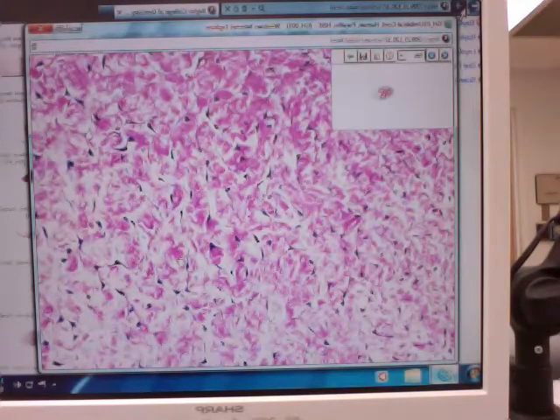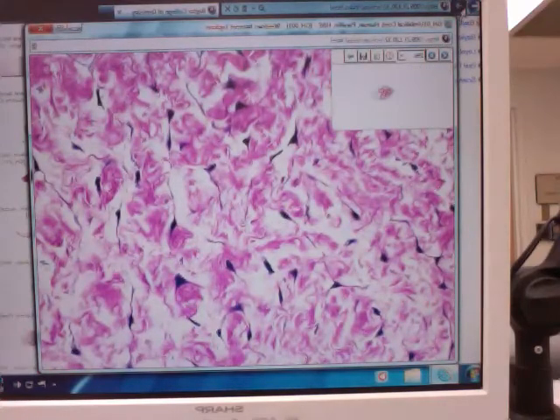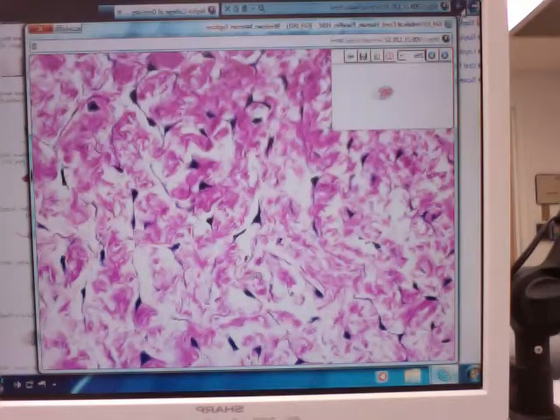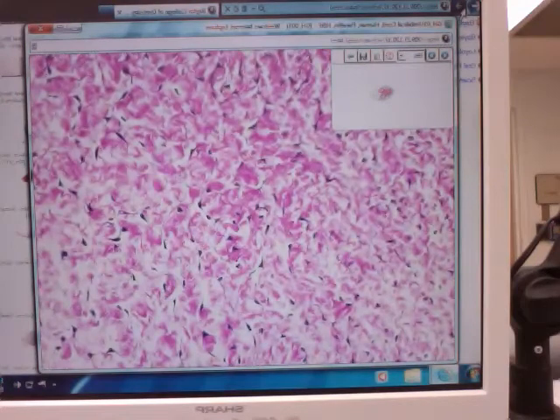Plus, if you look, all these cells have that true class. If you want to show somebody what a fibroblast looks like, this is the perfect place, because you see all these little skinny, stretched out cells. They're just classic fibroblast in nature, a nucleus with all of its cytoplasm extended out from it, and then you got these bundles of fibers inside of there. Nowhere else do you see these, because these are newly formed fibroblasts and they haven't gone through a further round of differentiation. So they look different than what you'll typically see fibroblasts somewhere else. But classic fibroblasts, all these collagen fibers. You just got to look at this a few times to get the feel for that this is that embryonic connective tissue.